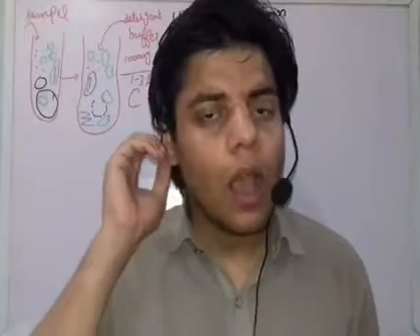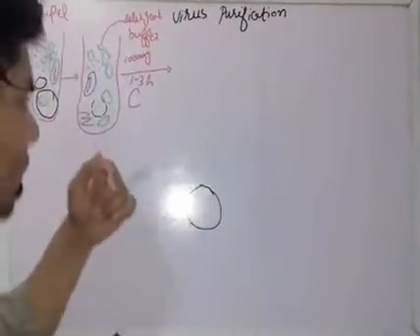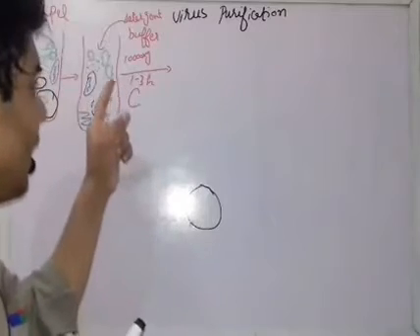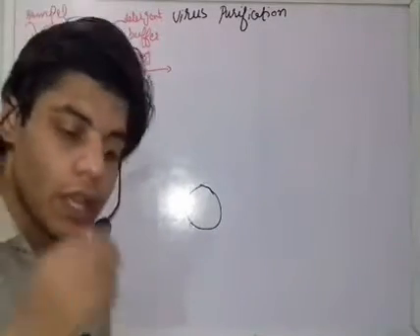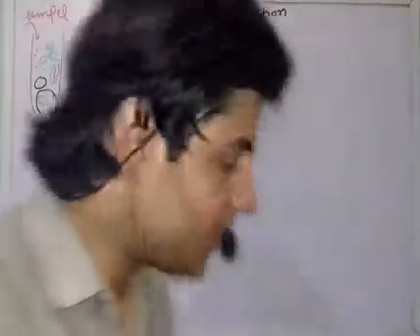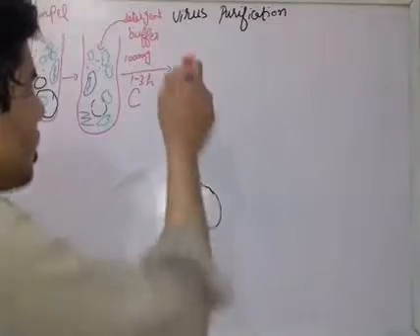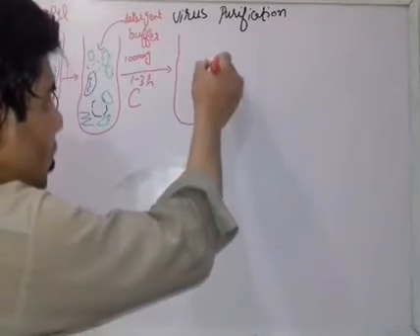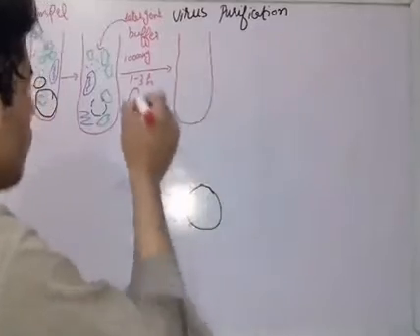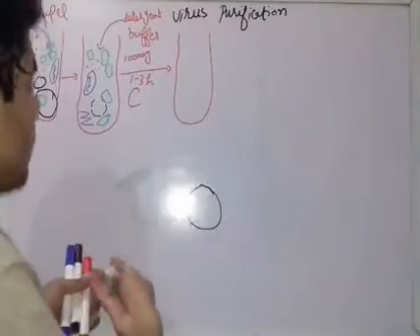Fine. So after the centrifugation, what happened in this case? Let's suppose we centrifugate this at 10,000 speed for 1 to 3 hours, and after the centrifugation we get the supernatant. Within the tubes we get the supernatant. What is supernatant actually?